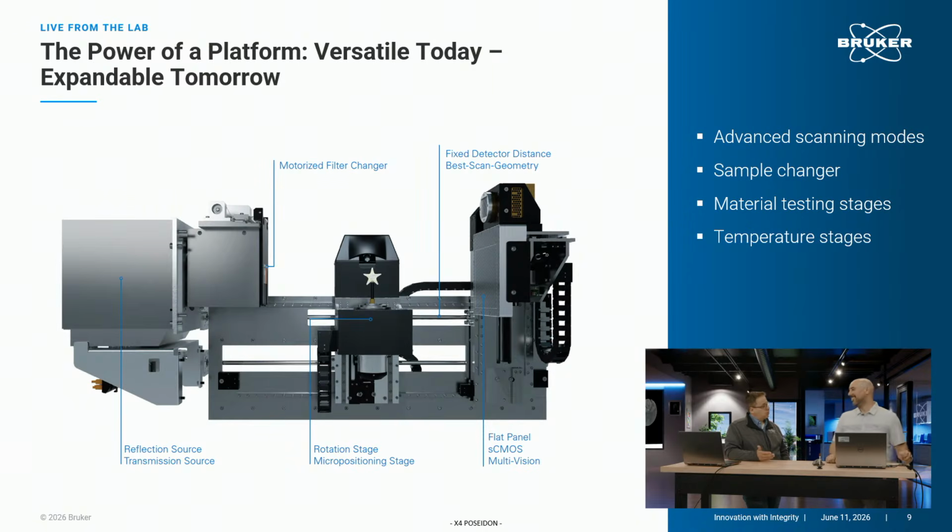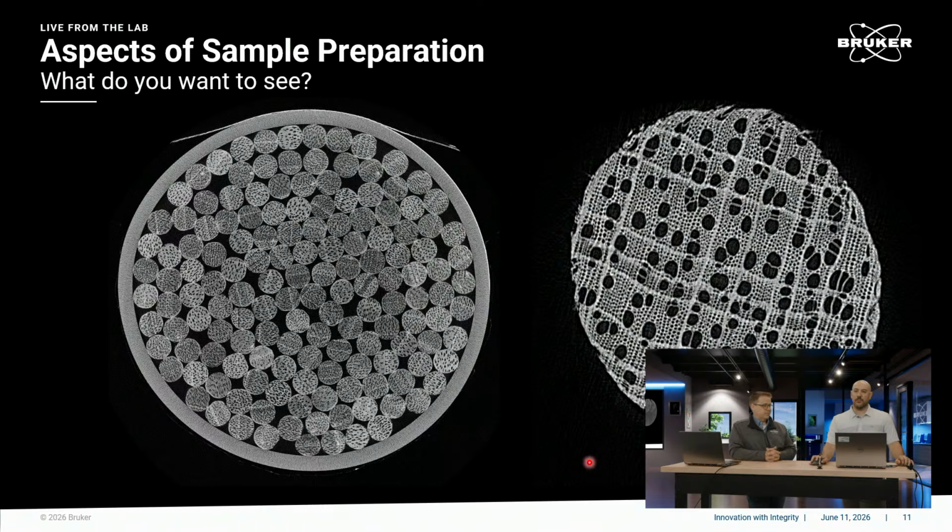But now that it's so approachable, the question becomes, how do you set up a scan? Because you could put the sample there at the right resolution. You can move the whole thing up, get a little bit more speed. But maybe you don't always want to because maybe you can get a little better contrast. So it depends. Let's start with this. First things first, you need to be scanning at the appropriate resolution. You need to make sure that your sample size is representative of the feature size you're interested in.